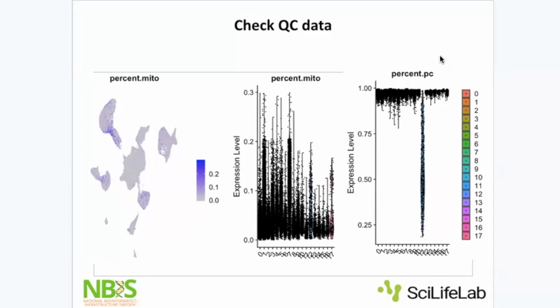We'll talk more about this, I think, also after cell type prediction, and in the end, what you can trust and using your common sense when it comes to these kinds of things. None of the methods are perfect. So it could also be that your clustering is correct and your cell type annotation is wrong. Who knows? Okay. But we can look at it more, perhaps on the bring your own data day, if you have your data. Okay, nice.